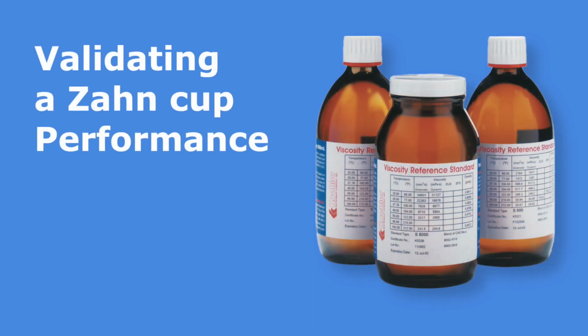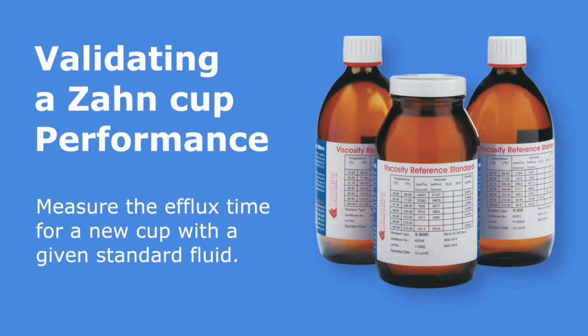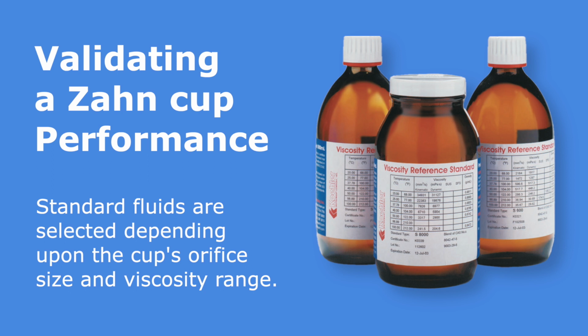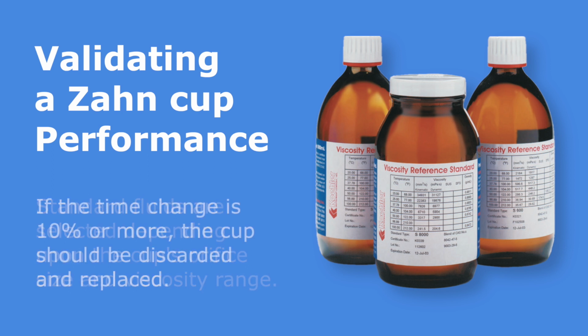A useful checking technique is to measure the efflux time for a new cup with a given standard fluid, then check the cup periodically with the same standard fluid at the same temperature to determine if the efflux time has changed. Standard fluids are selected depending upon the cup's orifice size and viscosity range. If the time changes 10% or more than your process tolerance permits, the cup should be discarded and replaced.